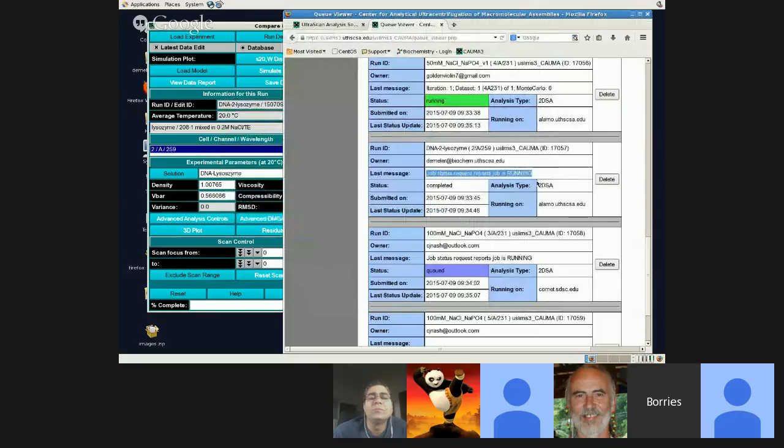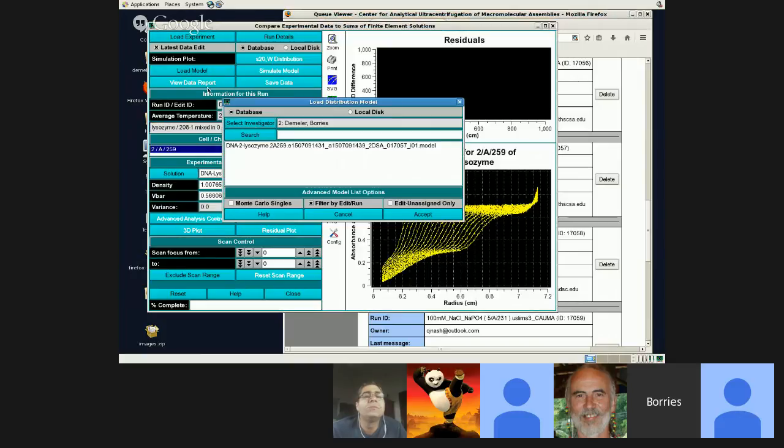Gary, why does it say job status request reports job is running, even though it's completed? So there's still some problem with the queue viewer not reporting the correct job status, because I know this job should be finished by now. It never takes more than six seconds. So there's apparently some problem with this particular job here right now. Sorry, we're running into all kinds of unexpected problems today. But the model appeared, so let's not worry about it.